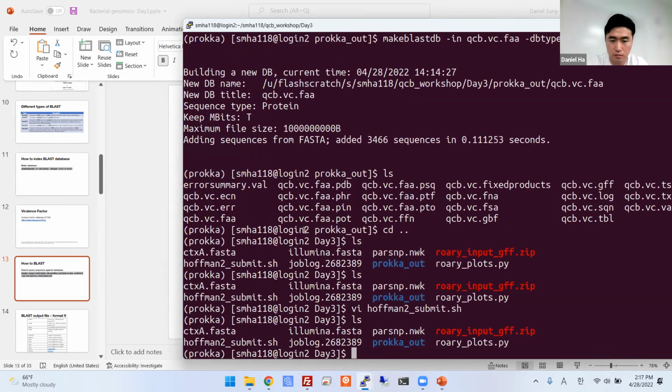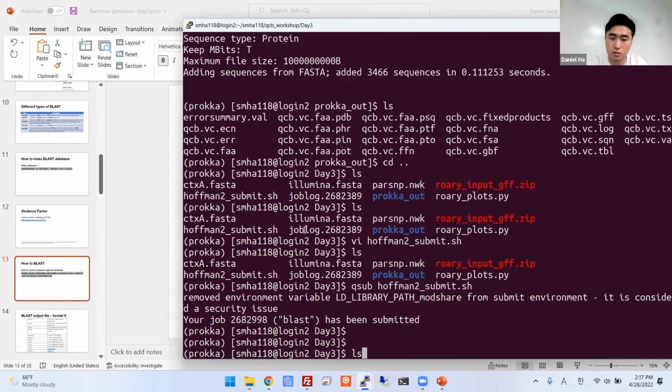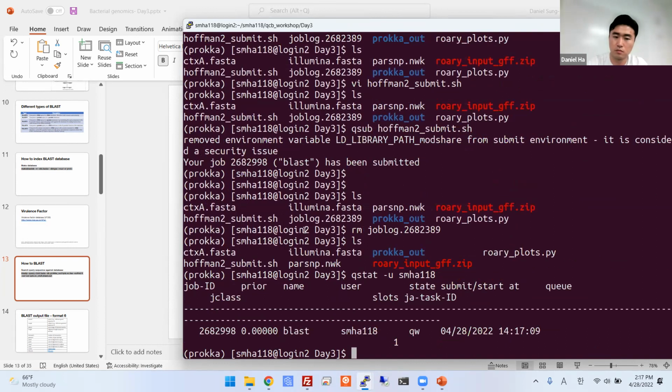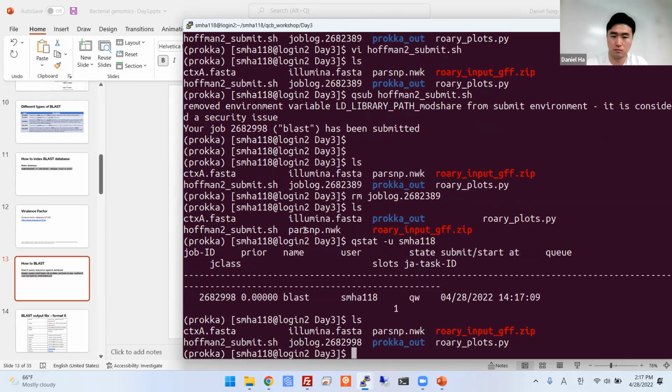Then submit the script. What were the parameters here?